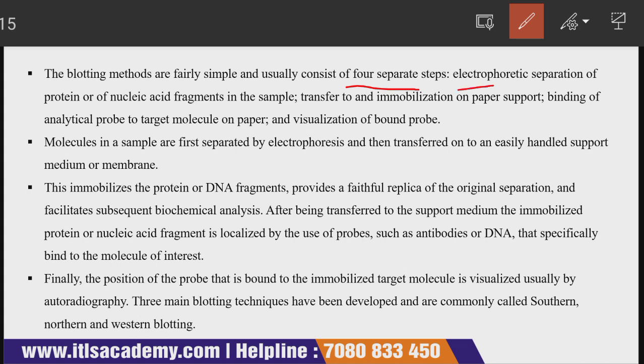The first is the electrophoretic separation of protein or nucleic acid fragments in the sample. Second is the transfer and immobilization on a paper support. Third is the binding of an analytical probe to the target molecule on the paper. And fourth is the visualization of the bound probe.